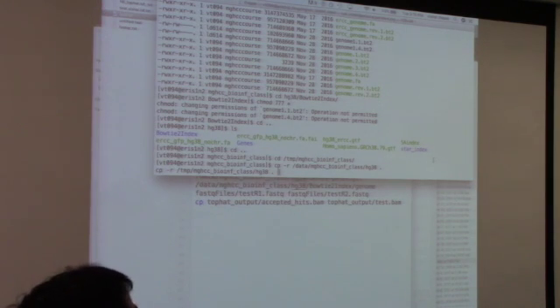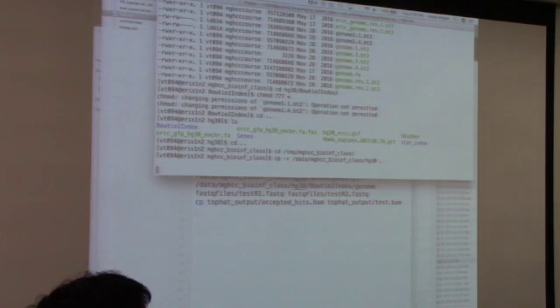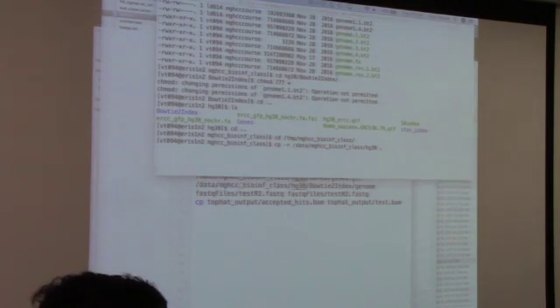Alright, so for now, has everybody just typed this out without pressing enter? Is there a space after the dot? There is no need for a space. Okay, I'm just going to erase this. But there's one before. Yes, there is one before. Okay. So it's still copying, still copying.